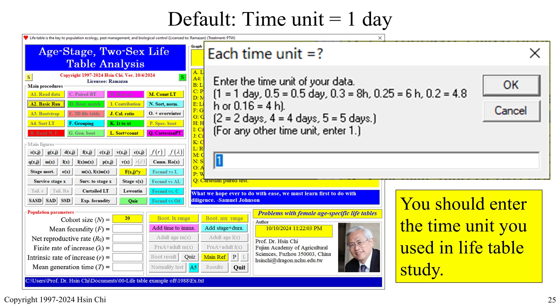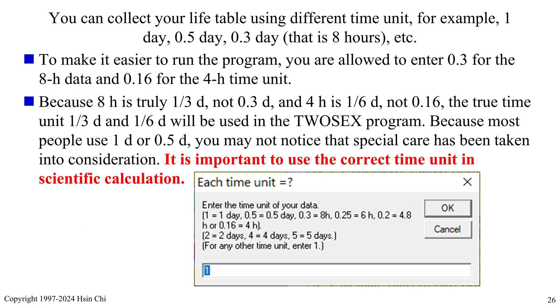When you see the time unit message, you must enter the correct time unit for your data. You can collect your life table using different time units — for example, 1 day, 0.5 day, 0.3 day (8 hours), etc. You may enter 0.3 for the 8-hour unit and 0.16 for the 4-hour unit. Because 8 hours is truly one-third day and 4 hours is one-sixth day, the true time units will be used by the 2-Sex program.